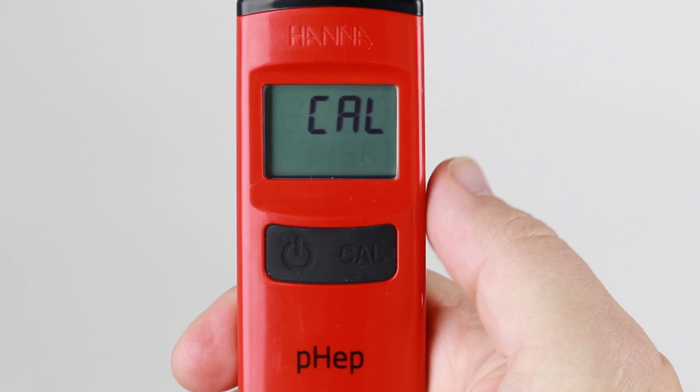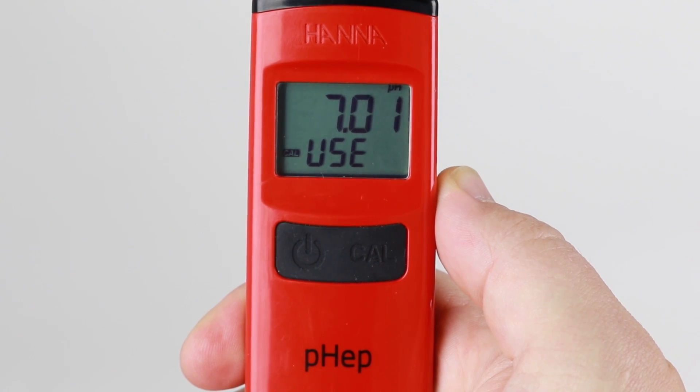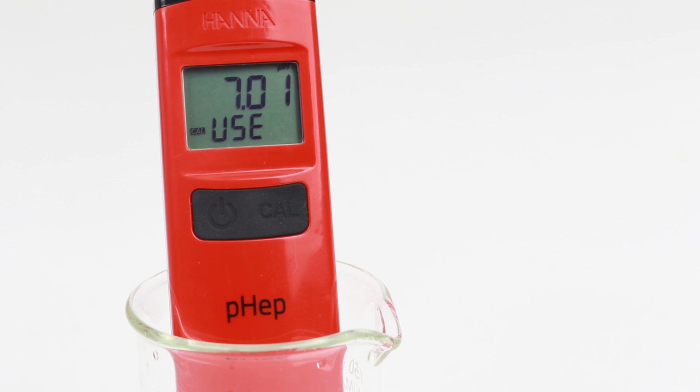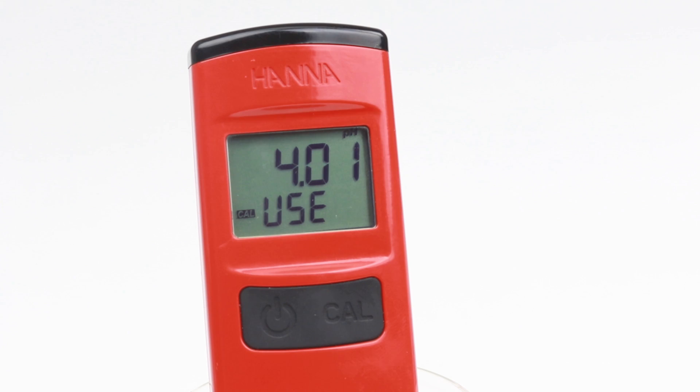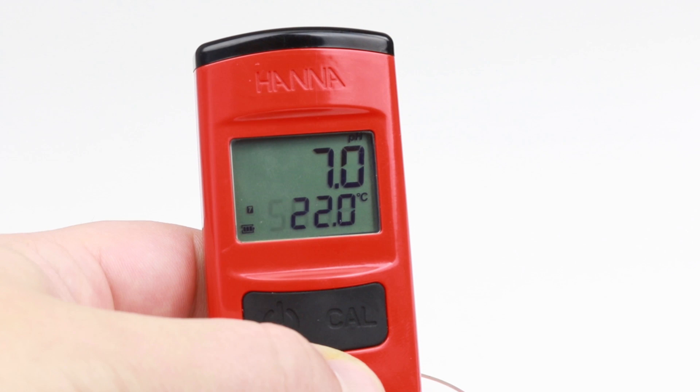To calibrate the meter, press the CAL button while the meter is on to enter calibration mode. For two-point calibration, the meter will prompt for the pH 7.01 buffer. Once the buffer is automatically recognized, it will be updated and REC will be displayed, and the meter will then display pH 4.01. For single-point calibration, press the CAL key to exit. A save message is displayed and the meter returns to pH measurement mode.